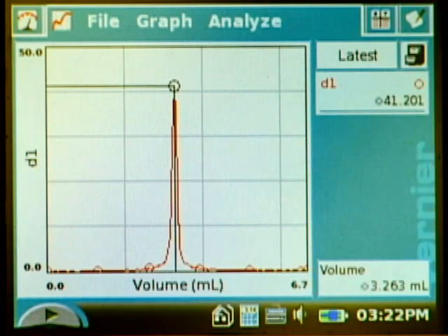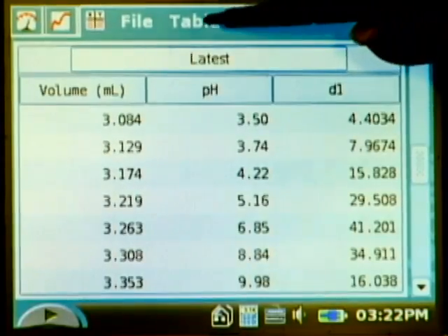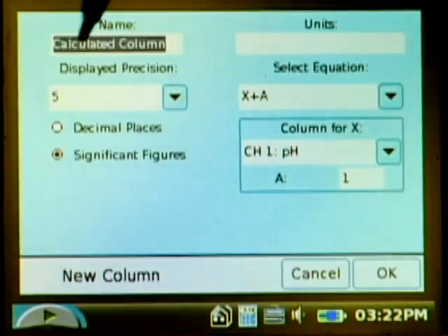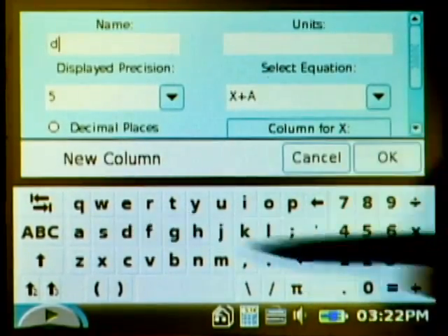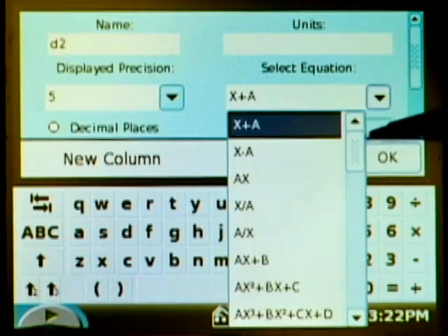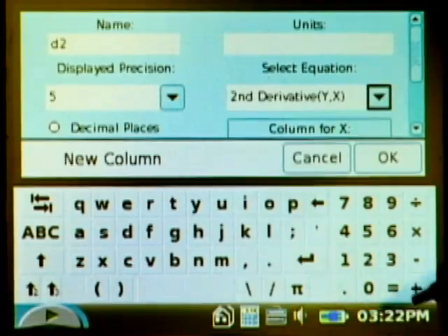Another way is the second derivative. I'll go ahead and create that column too under table, new calculated column. We'll name this one d2 and the equation second derivative of y with respect to x.